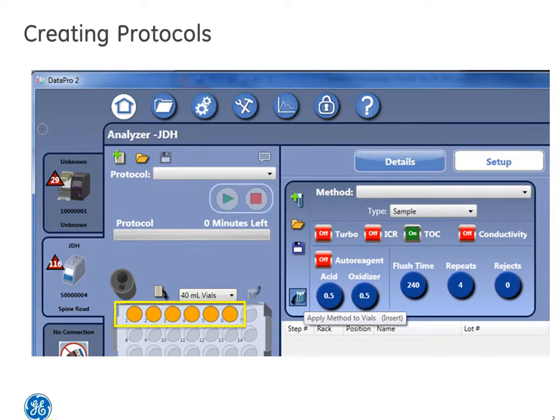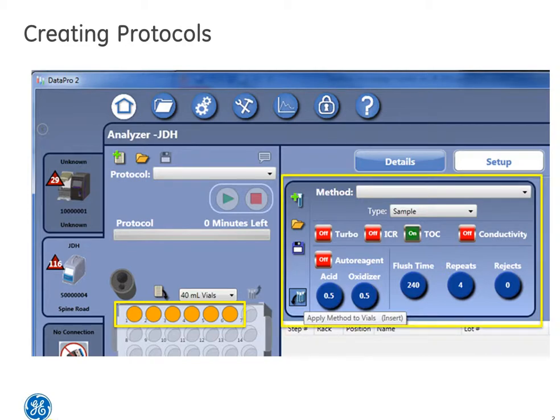Once you've selected the vials for the protocol, we need to apply the methods that are needed for the run. As you can see here, this protocol is utilizing a TOC method with four repeats, zero rejections, and the appropriate flow rates for the sample types.